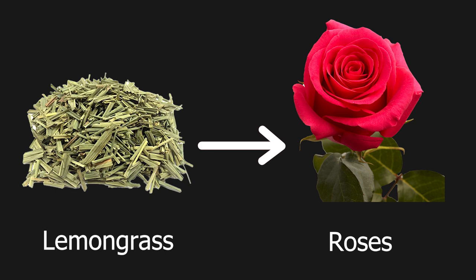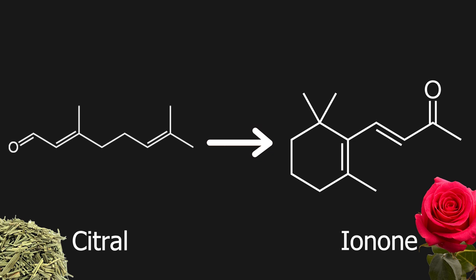In this video, I will be using lemongrass to make the smell of roses. Specifically, I will extract citral from lemongrass, which has a strong lemon smell, and turn it into ionone, which smells like roses. To do this, I will first take lemongrass and extract its essential oil through steam distillation.